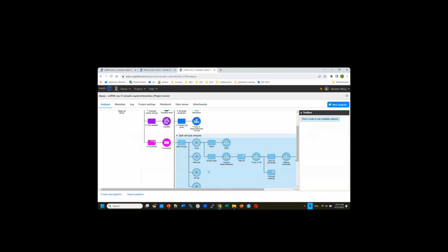After you've done that, that will give you the different data nodes. So this data node, if you mouse over, it will tell you you still have your 12 samples, and there are only B cells. It's 4,000 B cells. Within that, it's almost like you purified your cells. Now I only focus on B cells.